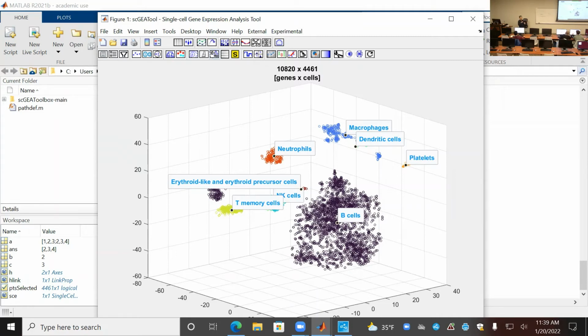And then I have an algorithm to assign a relative value for each cell population. Yeah, we will discuss this in the middle of the semester, how exactly it should be done.